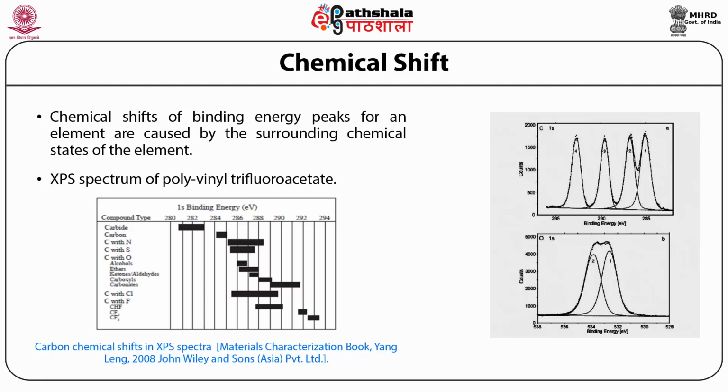Similarly, oxygen atoms in two different environments also generate two peaks as shown in Figure 1b. The XPS spectra shown in Figure 1, with defined peak positions and relative peak intensities, can also be used as a fingerprint to identify PVTFA.